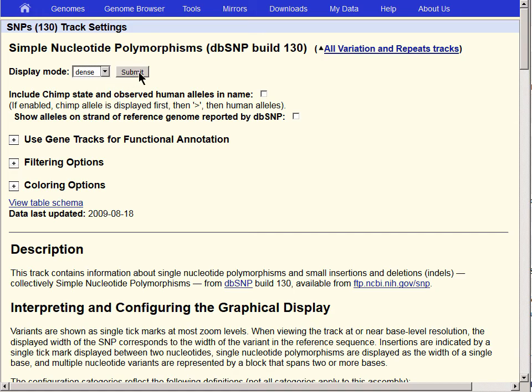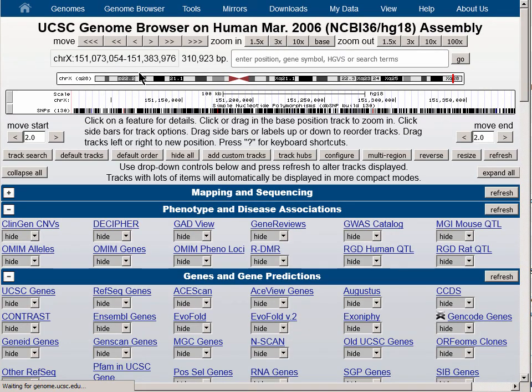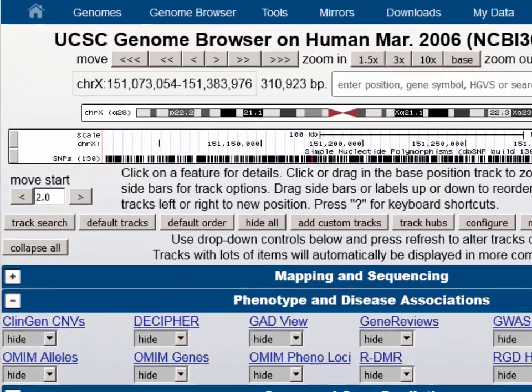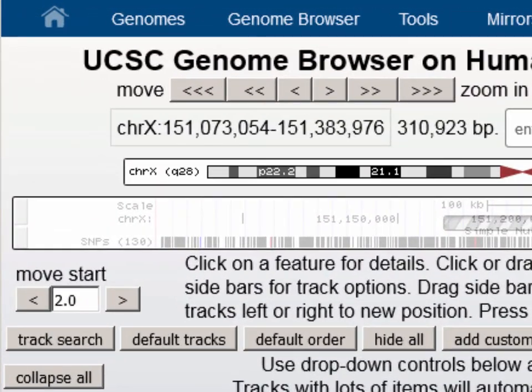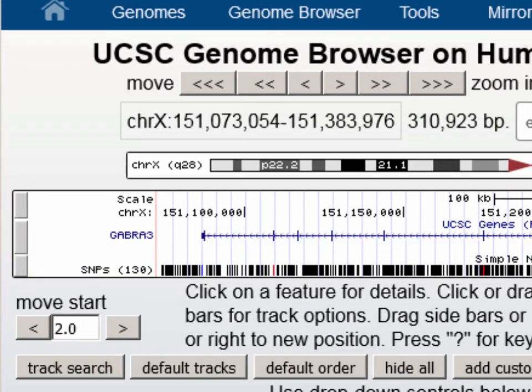This shows us all the SNPs in version 130, and let's turn on the gene track, UCSC Genes, to pack, so we will see the scale. We have 310,000 bases, and we have the default gene GABRA3. The region is annotated by many SNPs.